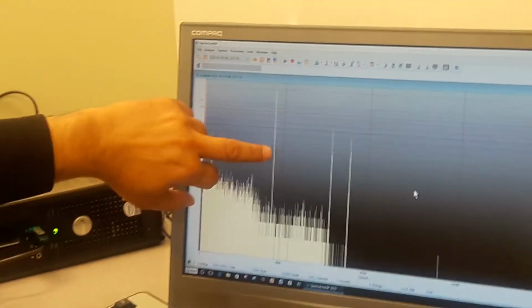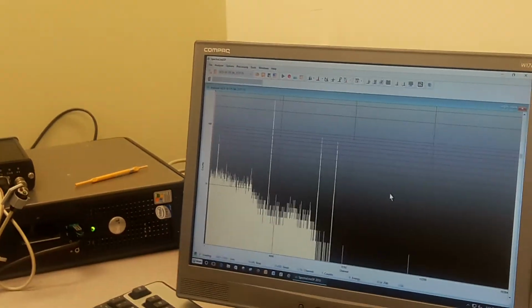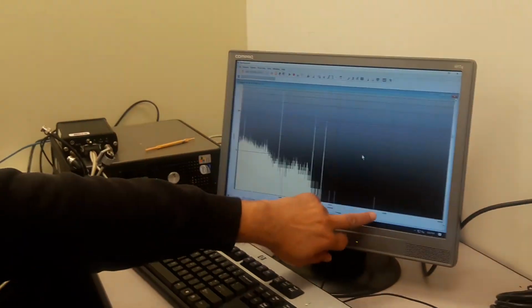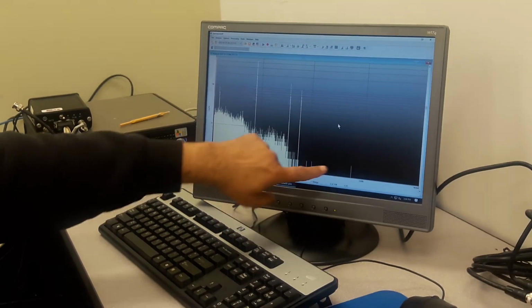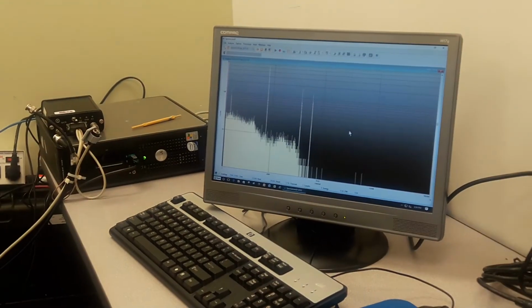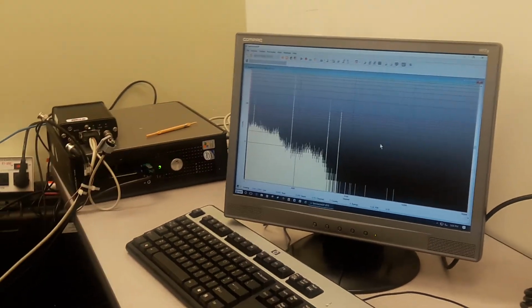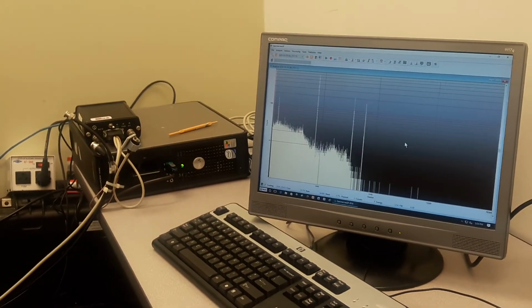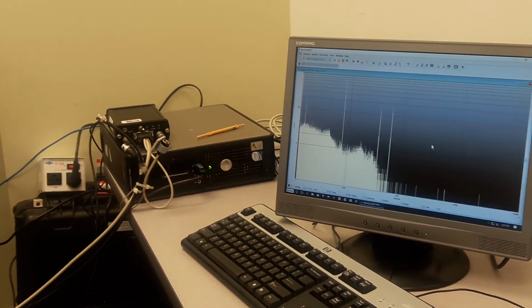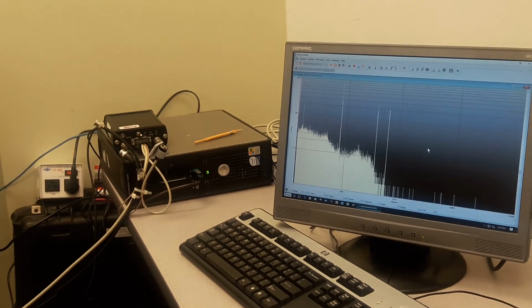And again, we are doing a calibration spectrum that you can see from our previous video. It has a cadmium, cesium and 2 cobalt peaks. And this is probably the sum peak from the 2 cobalt peaks, because my sample is sitting fairly close to the end cap of the detector. But I still like to keep my sum peak in here to see. This is approximately the 2500 keV line that I can see to see the upper end of my nuclide range, and the lower end is around 88 keV from cadmium 109. I'm going to let it count right now for 600 seconds, and after that we're going to go through a peak search. We're going to save it, and then we're going to go through energy calibration, shape calibration and efficiency calibration. You can stop here.